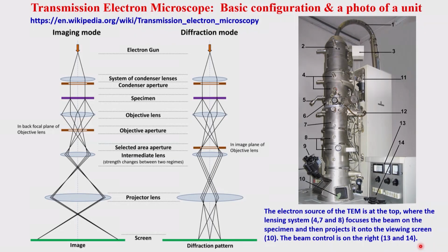Okay, so let us look at some idea, because earlier we have also seen in the case of AFM the configuration, how it works. Now let us look at the two configurations given here. I draw your attention to this particular slide, and of course the working principle can be checked from this particular link. You can always see there is a video, and two configurations are given, one for the imaging mode, one for the diffraction mode.